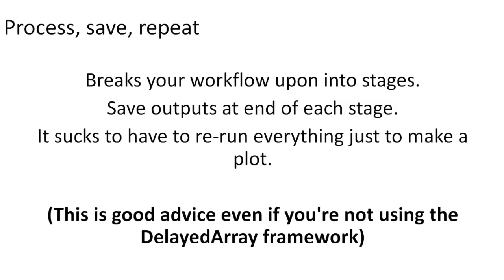When working with large data, it helps to break your workflow up into stages. At the end of each stage, save your outputs, for example using the saveHDF5SummarizedExperiment function. It really sucks to have to rerun everything just to make a plot, and this is good advice regardless of whether you're using the DelayedArray framework or not for processing large data.